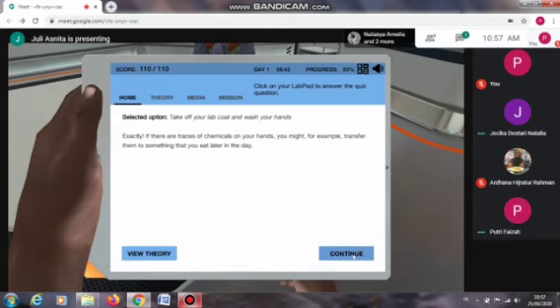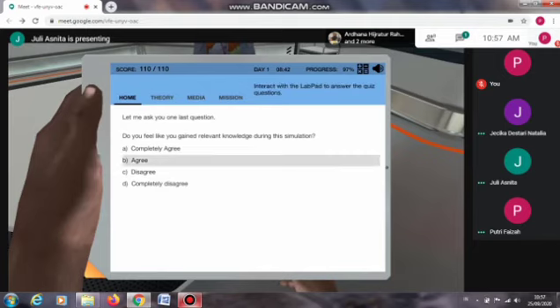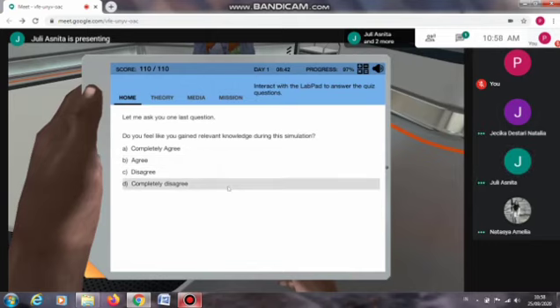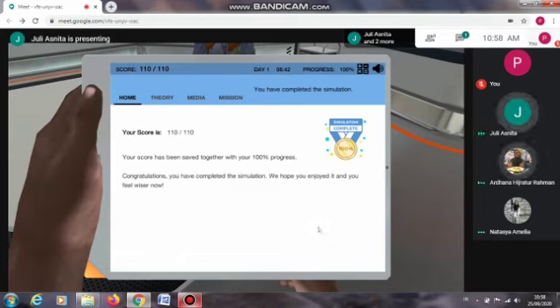Continue. Let me ask you one last question. Do you feel like you gained relevant knowledge during this simulation? Completely agree. Option A. Thank you for your feedback. Your score has been saved together with your 100% progress. 110 per 110. Congratulations, you have completed the simulation. We hope you enjoyed it and you feel wiser now.